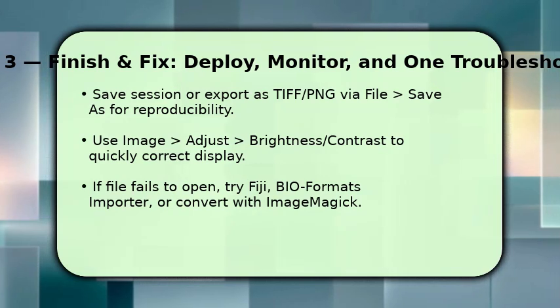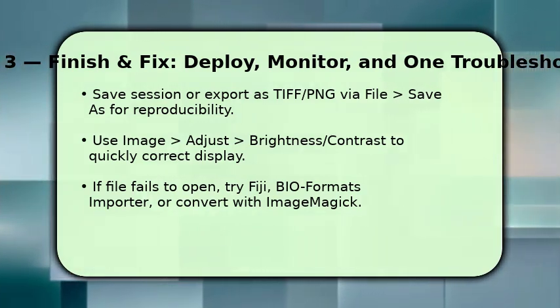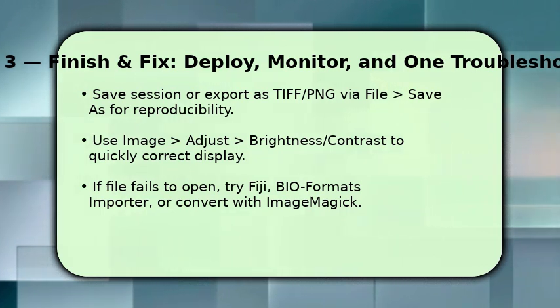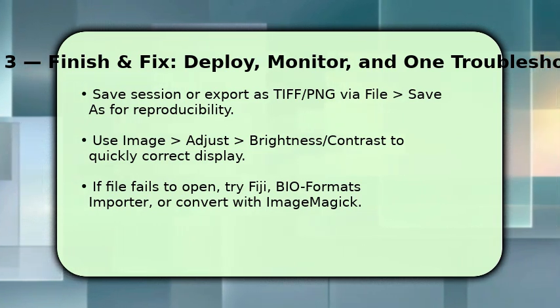To finish, save a working copy and export in the format you need, because that preserves your settings and makes results reproducible. You can also adjust display with brightness/contrast or apply simple filters before saving. This does not alter original data unless you choose Save.